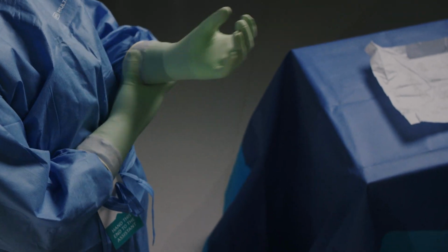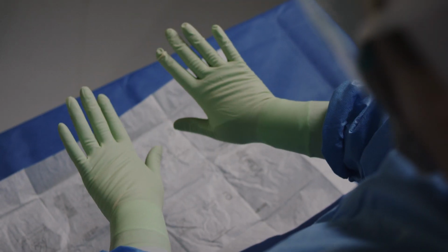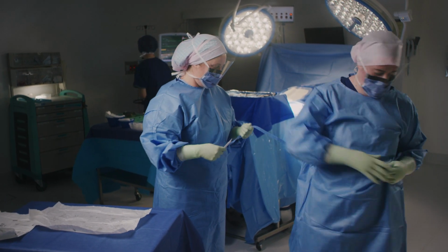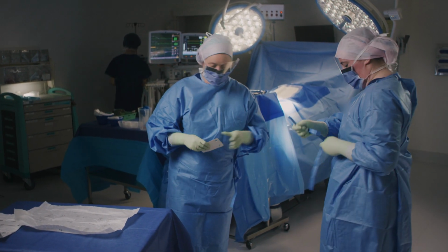After double gloving, the team member adjusts their gloves as needed and inspects for integrity. The scrub nurse can assist the team member with the final gowning process.